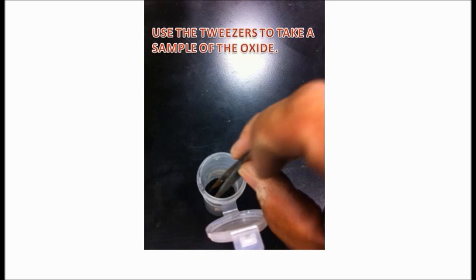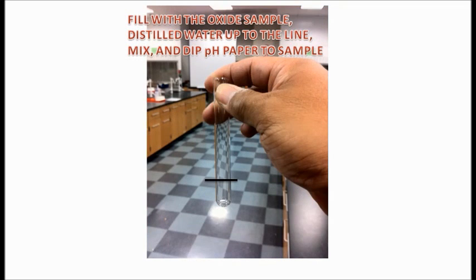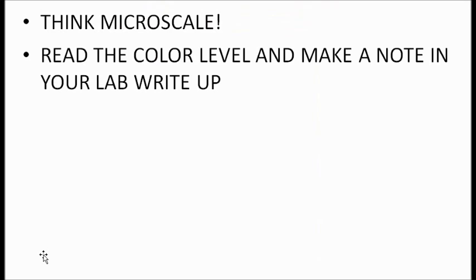Use the tweezers to take a sample of the oxide. Keep it tiny. Less is always more in this case. And then I want us to take that sample, put it inside the test tube, and fill that test tube with about yay much water. Not really that much. Roughly about a centimeter long. Fill it with water and mix it up. And after you mix it really well, dip the pH paper to sample it, and then read it by using the vial. Think microscale, guys. Read the color level and make a note in your lab write-up.